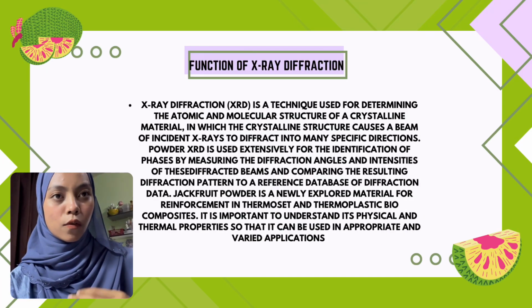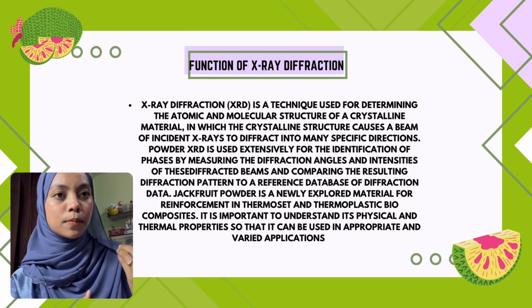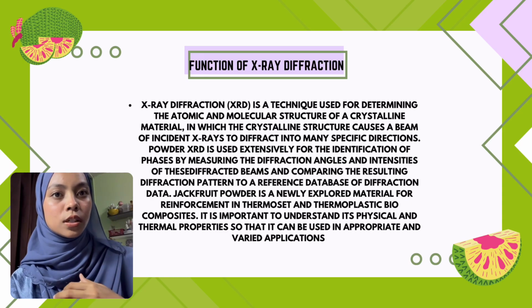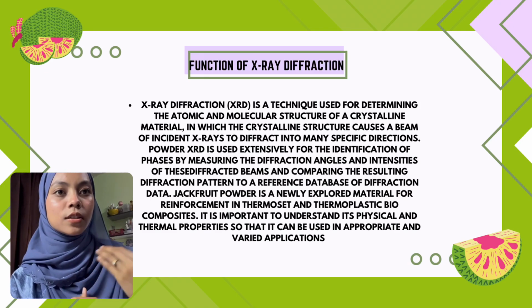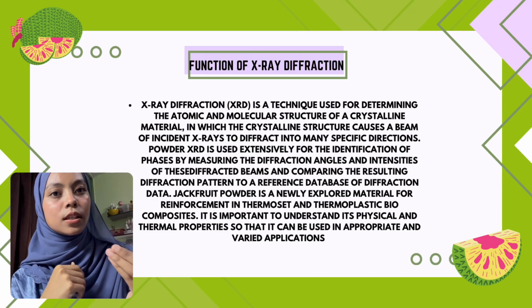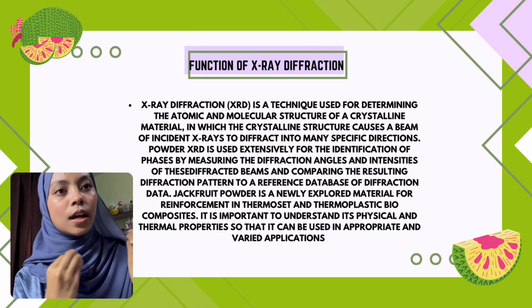Today, I want to talk about the function of X-ray diffraction. X-ray diffraction is a technique used for determining the atomic and molecular structure of a crystalline material, in which the crystalline structure causes a beam of incident X-rays to diffract into many specific directions. Powder XRD is used for the identification of phase by measuring the diffraction angle and intensity of the diffracted beams and comparing the resulting diffraction pattern to a reference database of diffraction data.